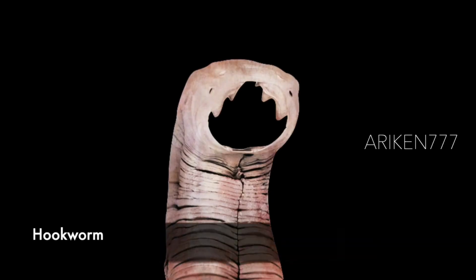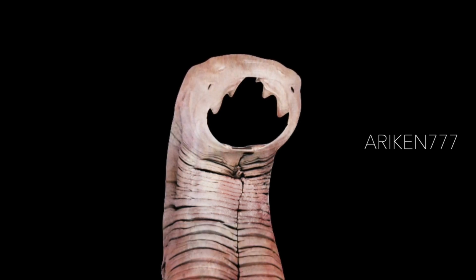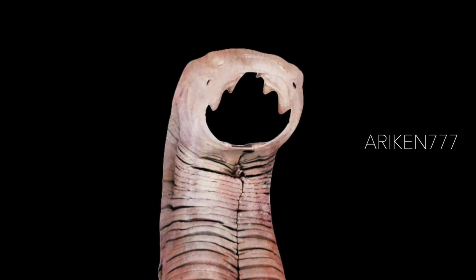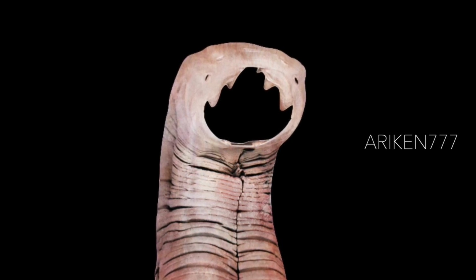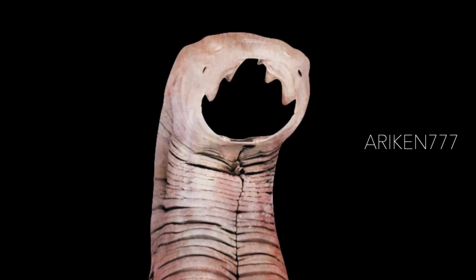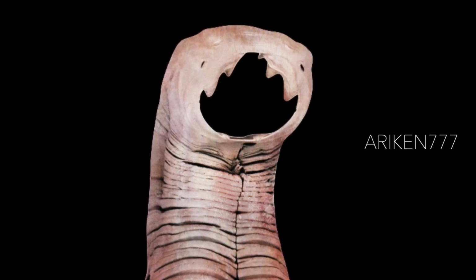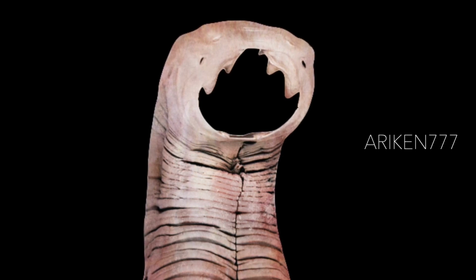Head of a hookworm. This is one of the common causes of hookworm infestation in humans, particularly in subtropical regions such as North Africa and India. The worm's head contains several tooth-like structures with which it clings to the bowel of its host. Hookworms also infect dogs and cats. Human infestation begins with larvae penetrating the skin, usually by burrowing into the feet of a person and entering the bloodstream. The larva then migrates throughout the body, particularly the small intestine.